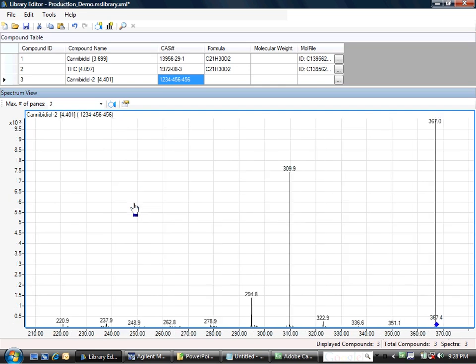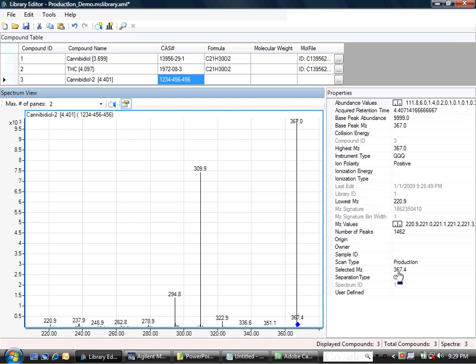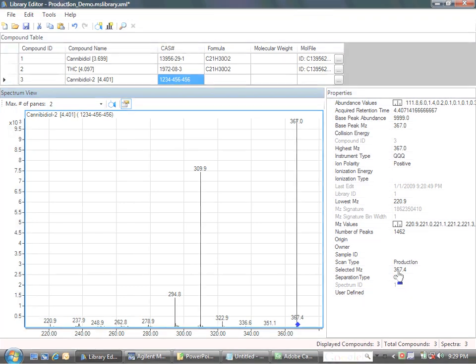Now notice this is a product ion spectrum. There's the precursor ion. I can check that by going over to the properties, and you'll see here that the selected M over Z, which is the precursor ion, is denoted as 367.4, which is the same as what's coming from the spectral quant description. So that gives you an idea of how you can create your own custom libraries from your data acquisition, taking the spectra and creating a spectral custom library. Thank you for your attention.